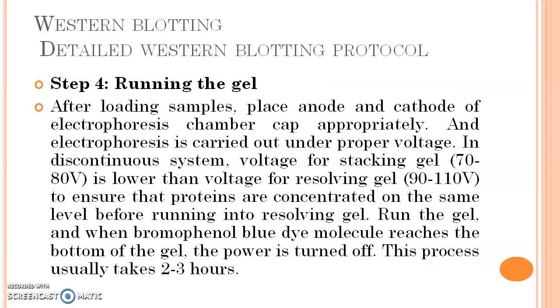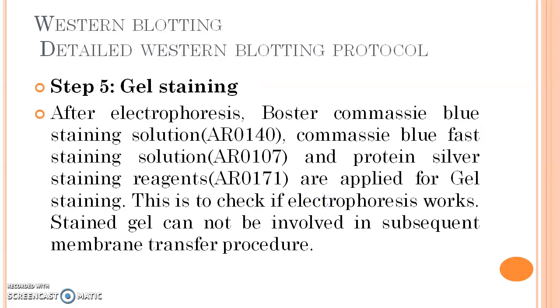After loading samples, place the anode and cathode of the electrophoresis chamber cap appropriately, and electrophoresis is carried out under proper voltage. In a discontinuous system, the voltage for stacking gel, 70 to 80 volt, is lower than the voltage for resolving gel, 90 to 110 volt, to ensure that proteins are concentrated on the same level before running into the resolving gel. Run the gel, and when the bromophenol blue dye reaches the bottom of the gel, the power is turned off. This process usually takes 2 to 3 hours.